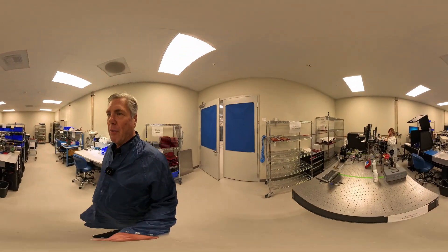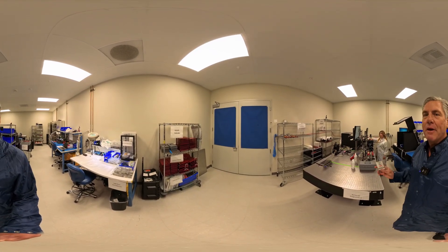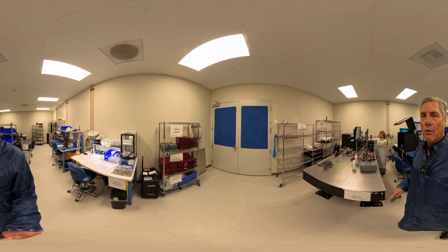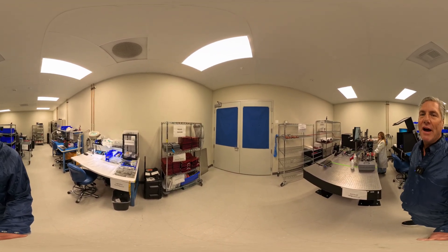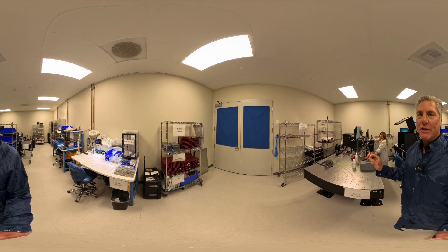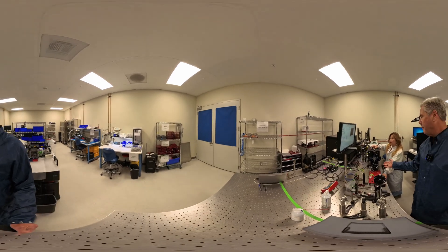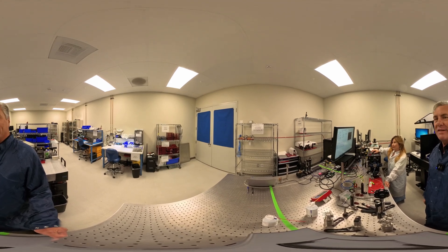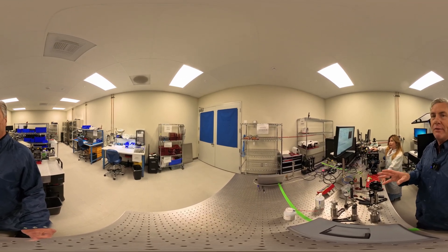Here we are where our manufacturing technicians are making the light pen. The light pen is the sub-component that allows us to take laser light and get it onto our smart cell, where we separate the light into channels that enable up to 25 million ZMWs to get an equivalent amount of light at the same time. You can see we're making the platform right here — a technician is manufacturing and testing the sub-assembly, and from here we'll take it to the manufacturing floor and integrate it into the Revio system.